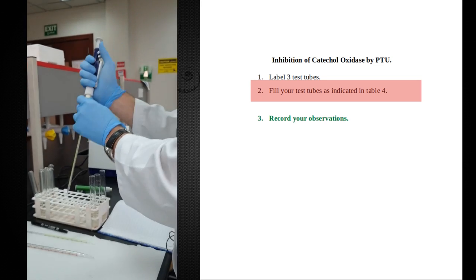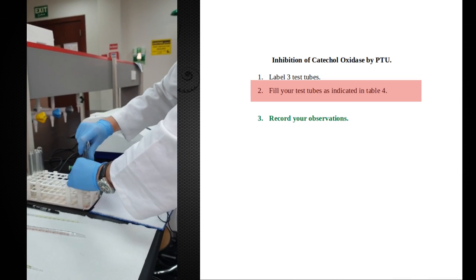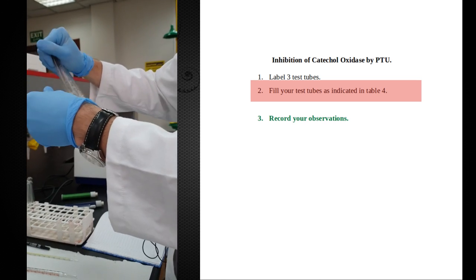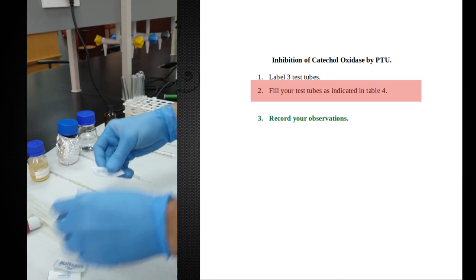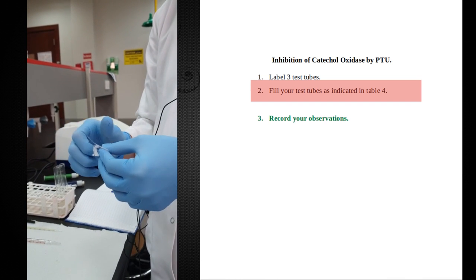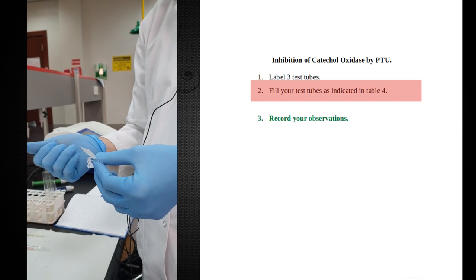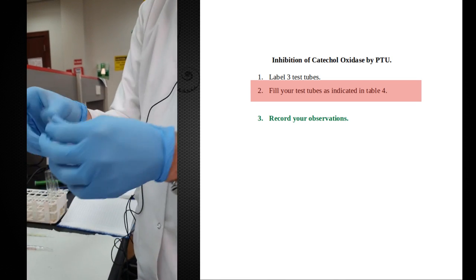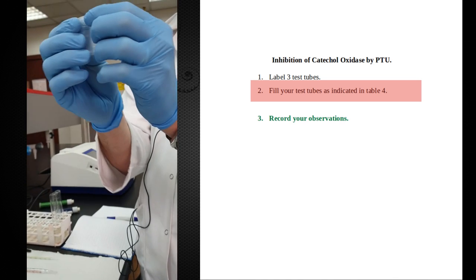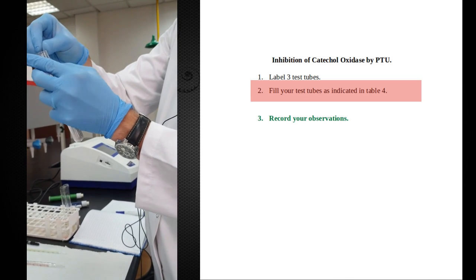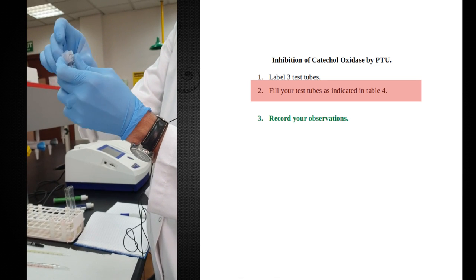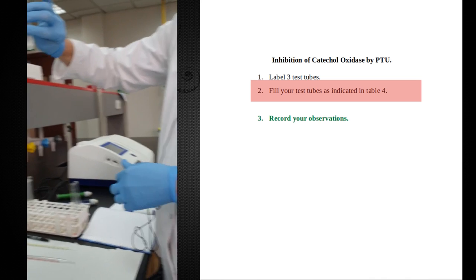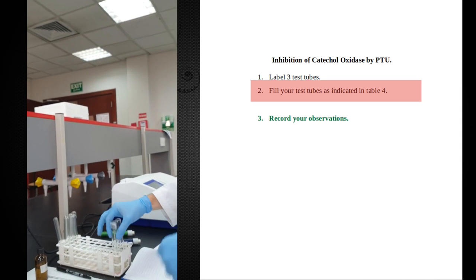As soon as this substrate goes in, the reaction begins. I'm going to use parafilm to help mix these. Parafilm is this really awesome stuff that's kind of like kitchen wrap, but so much better. It sticks to things really well, especially glass, and it stretches really well. To make it work well, you need to stretch it. I'm going to take half of this and stretch it both ways. Now that it's stretched, it's more likely to stick to things. As long as I have a dry surface here, it's going to attach very nicely to this tube. That's parafilm. It allows me to mix things very well, very thoroughly.